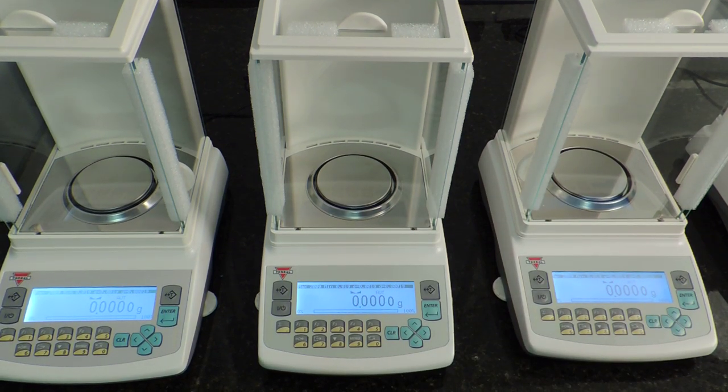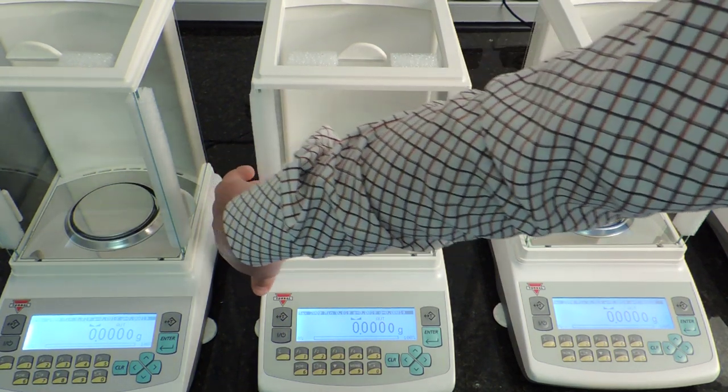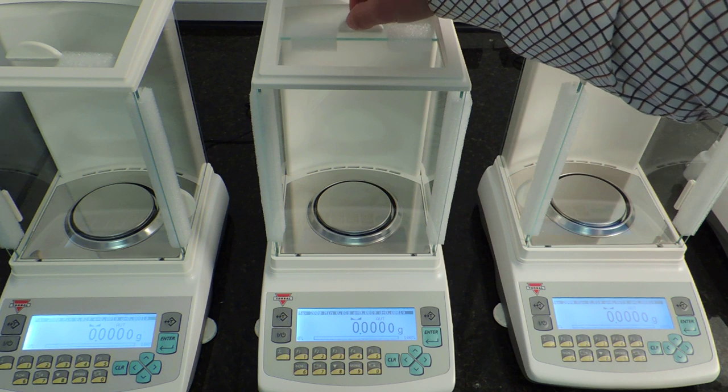A very nice weighing chamber, two sliding doors on both sides, and a sliding door from the top.